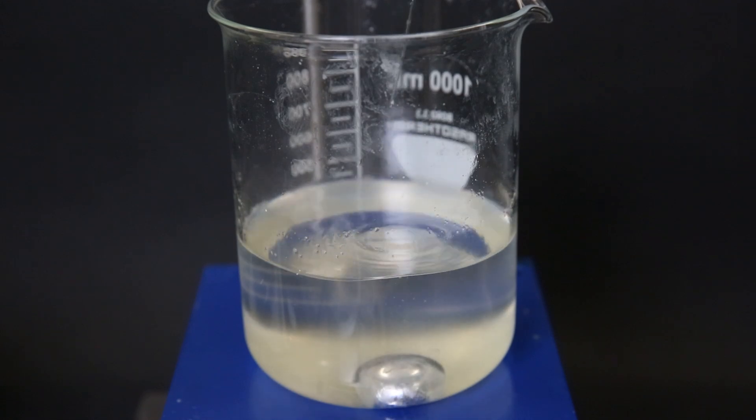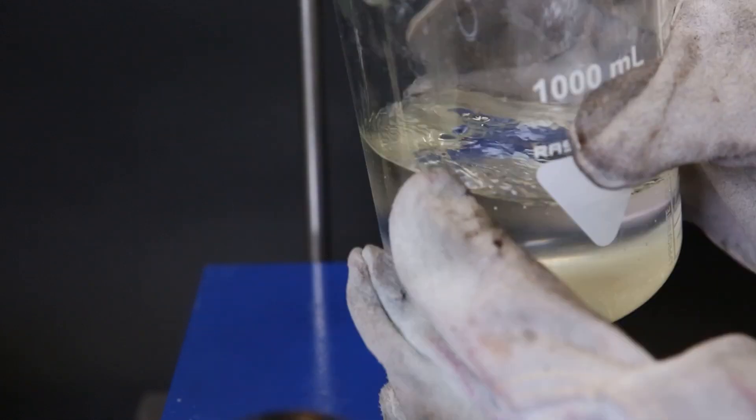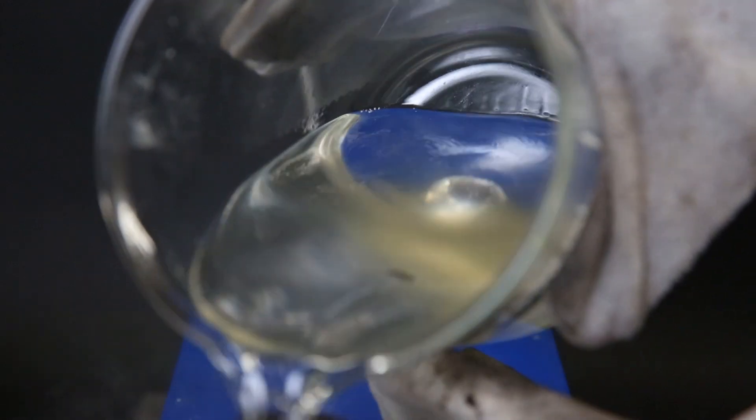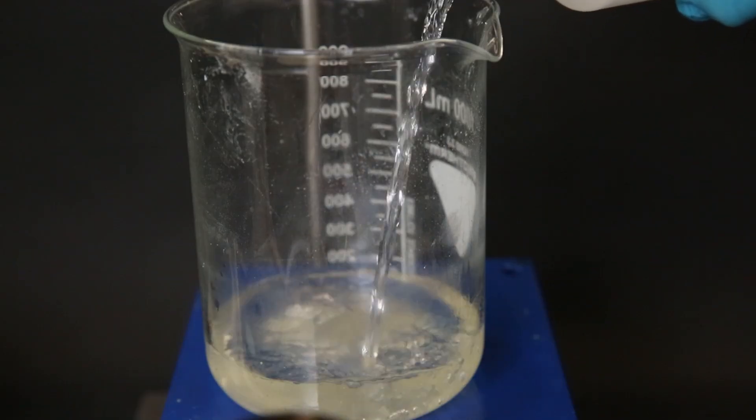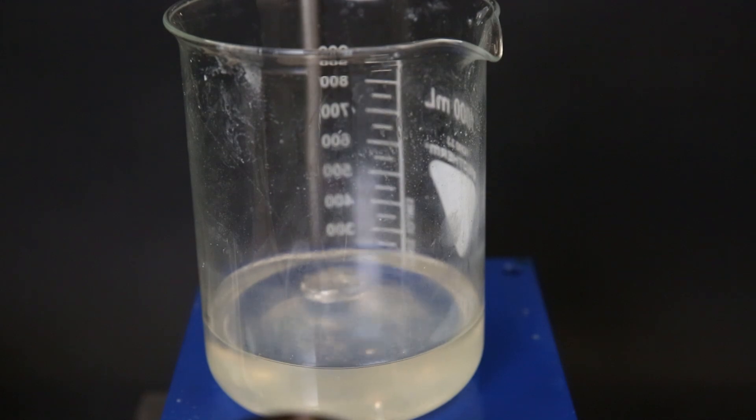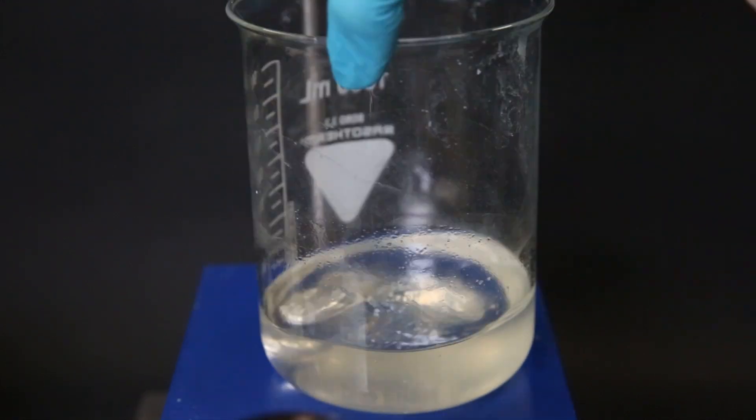So to quickly solidify the sodium I simply pour out most of the hot toluene and then I add in some fresh toluene. And now I have one big piece of solid sodium.